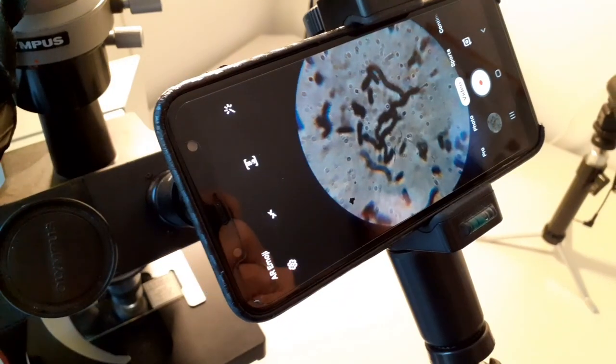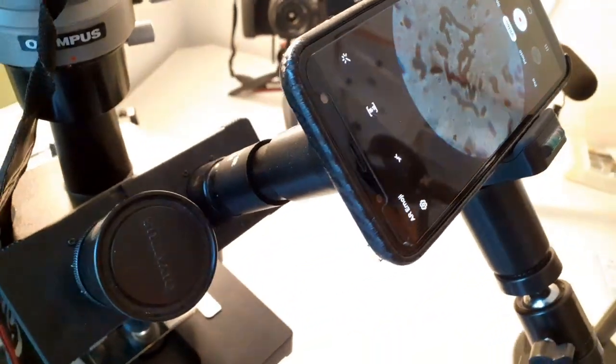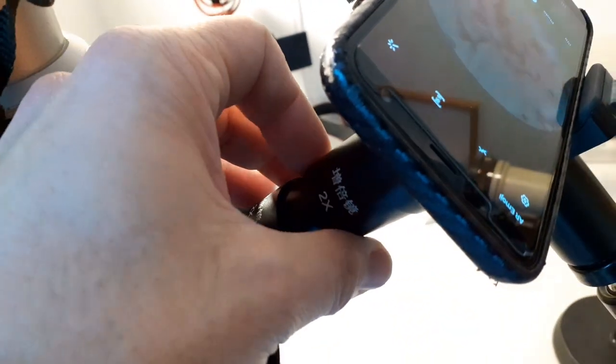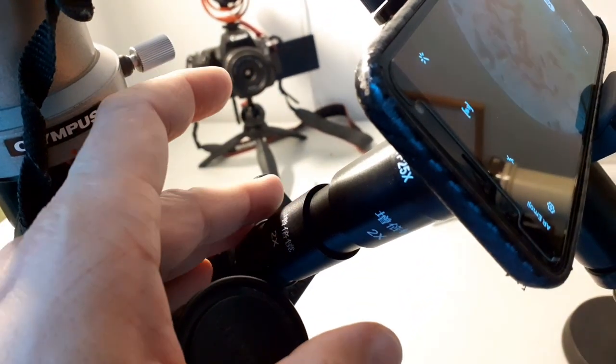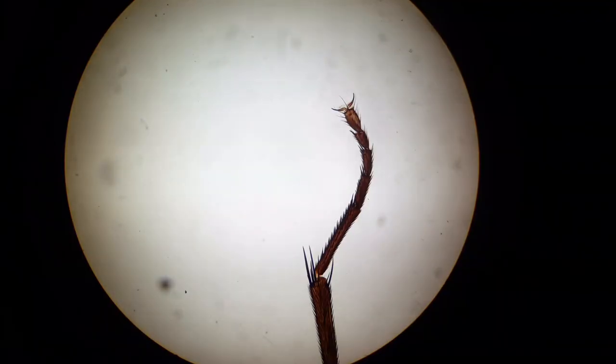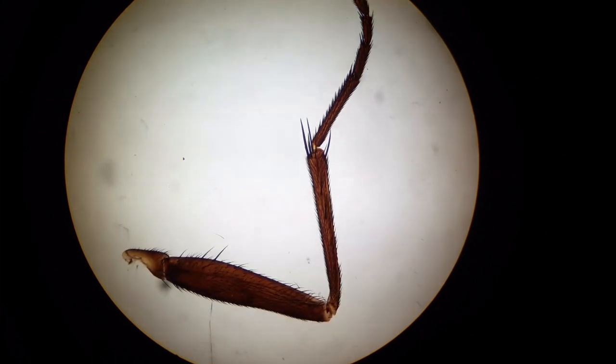That for a fraction of the cost. Now why don't they do that? It doesn't make sense because the resolution is not there, the image will become extremely dark and extremely blurry. You're not going to see anything. This is the setup I'll be using - 25 times eyepiece and two 2x Barlows giving a total magnification of the eyepiece system of 100 times.